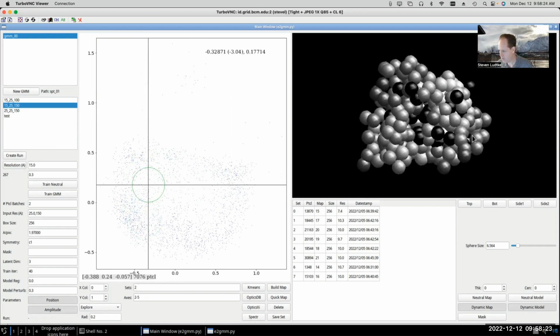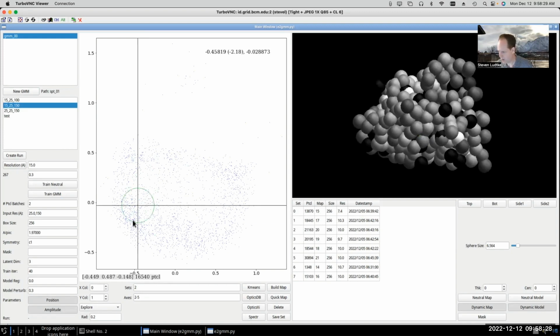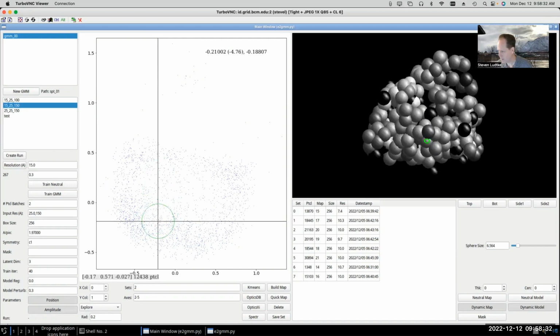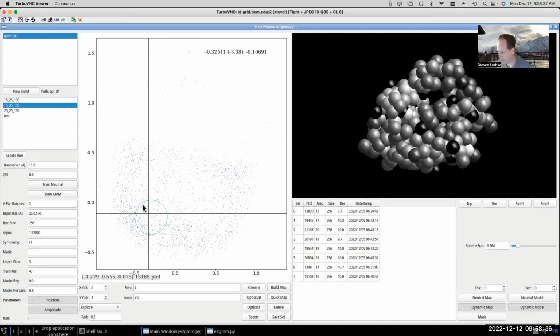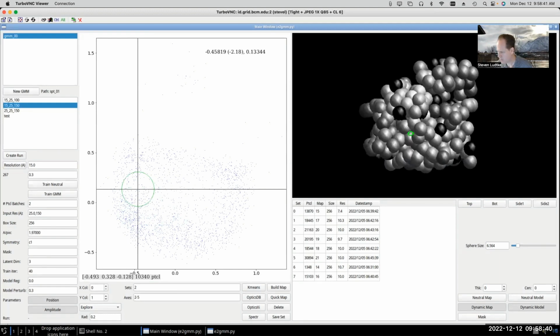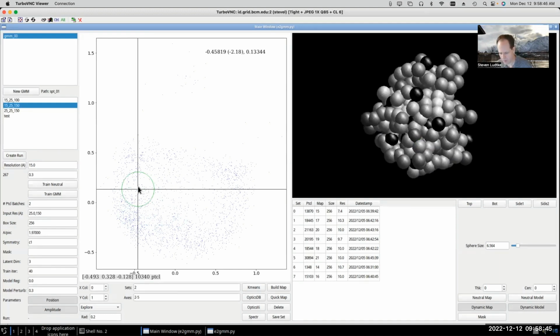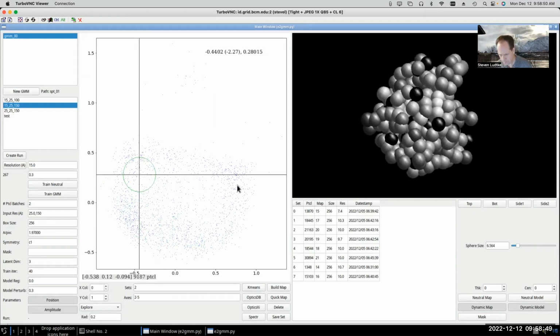So what we're looking at here is just the Gaussian model. So let's find an orientation here where we can see interesting sorts of things going on. So here's the channel through the ribosome, I think. So what I want to do is rotate this to put the channel in the plane of the screen, more or less. And this should be a good orientation for seeing kind of ratcheting motion. Okay. Now, you can see there's a list of things over here.